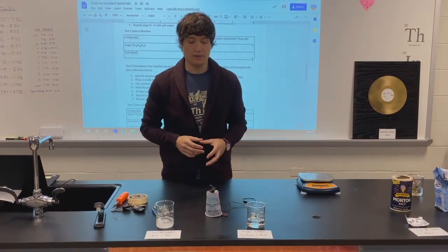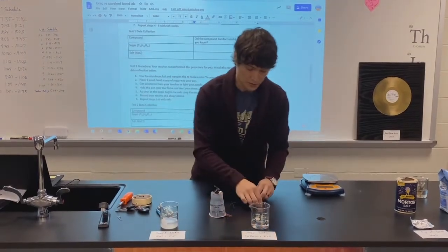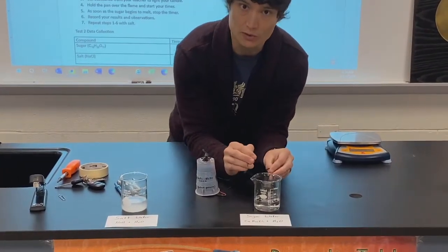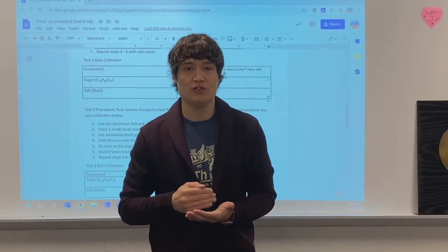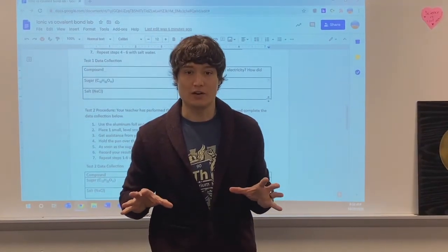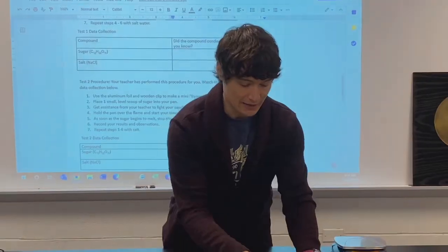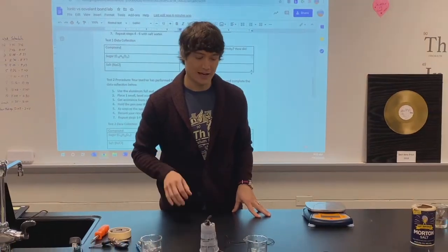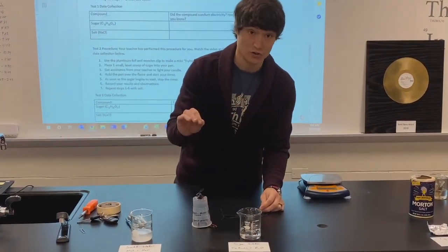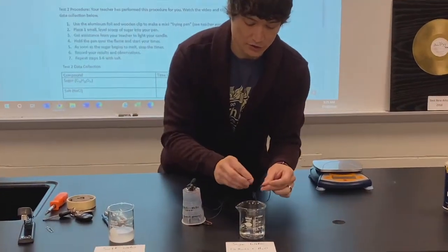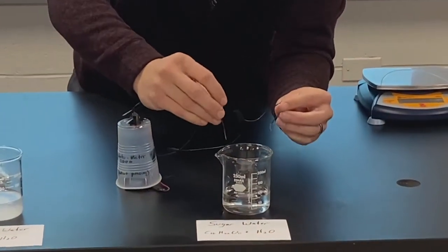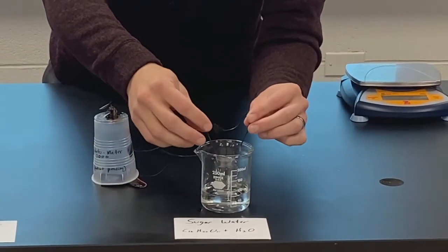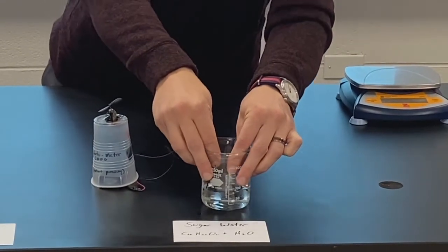Our different types of compounds — one will conduct, one will not. Let's test them out. I'm going to put one end of the probe into the water. Disclaimer: you are not going to introduce electricity to any liquids ever normally. This is extremely low current — I could even touch them. Nothing's going to happen because I'm only working off an AA battery, so there's not a whole lot of danger here. But normally you're never going to try something like this at home. Let's try the sugar water first. I'm going to put one probe in on one side of the beaker and the other probe in the other, to see if the electricity will actually run through the liquid and meet the other probe. You'll know if the propeller spins.